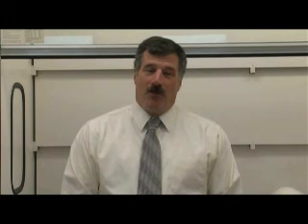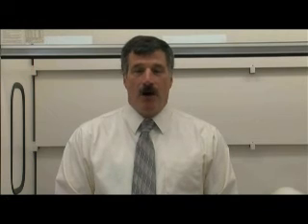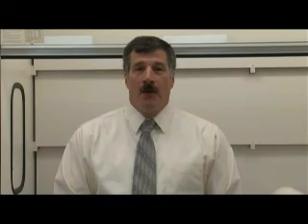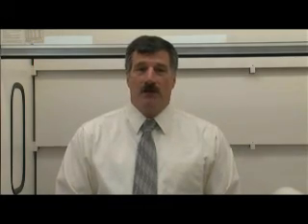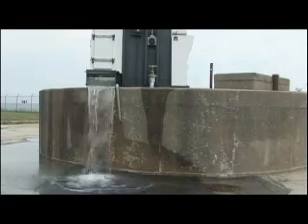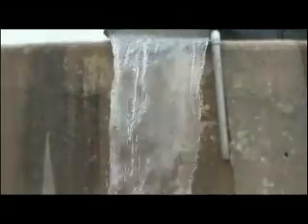The lab is a critical part of our treatment process. The lab is staffed by a chemist, a microbiologist, and our 5 water treatment plant operators in the filtration section. The lab is utilized 24 hours a day, 365 days a year, and some of the testing is done once an hour. The lab is utilized to monitor the quality of the lake or raw water to determine the proper chemical dosage to allow for the most effective treatment of water.